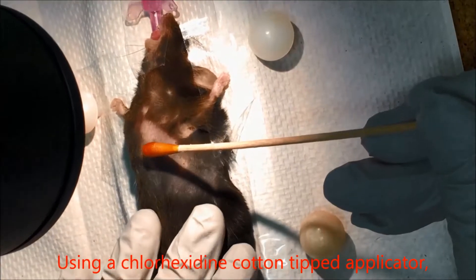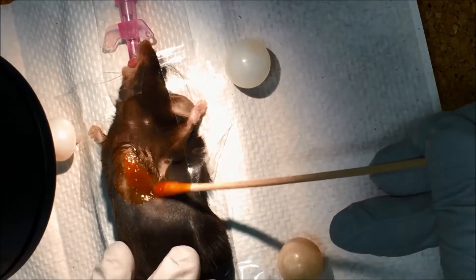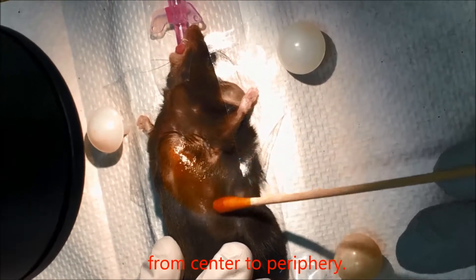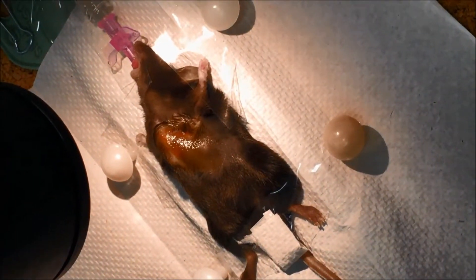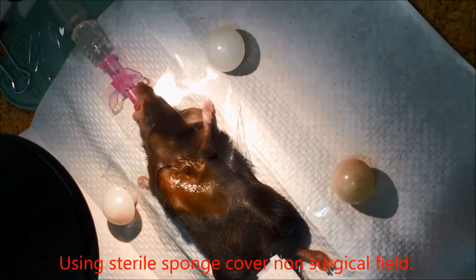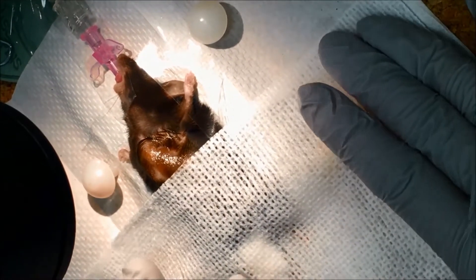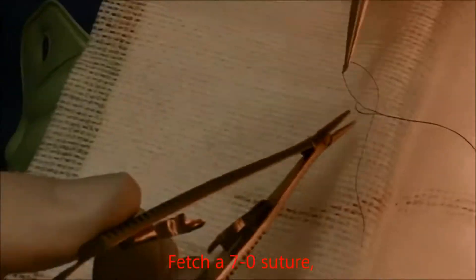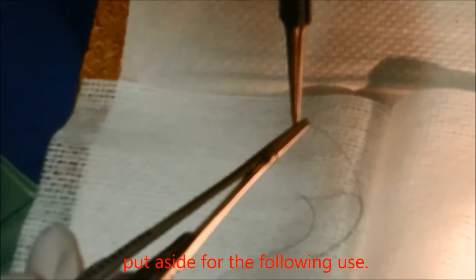Using a chlorhexidine cotton-tipped applicator, antisepticize the surgical site by cleaning in a circular motion from center to periphery. Using a sterile sponge, cover the non-surgical field. Fetch a 7-0 suture, hold it with a micro-needle holder, and put it aside for the following use.